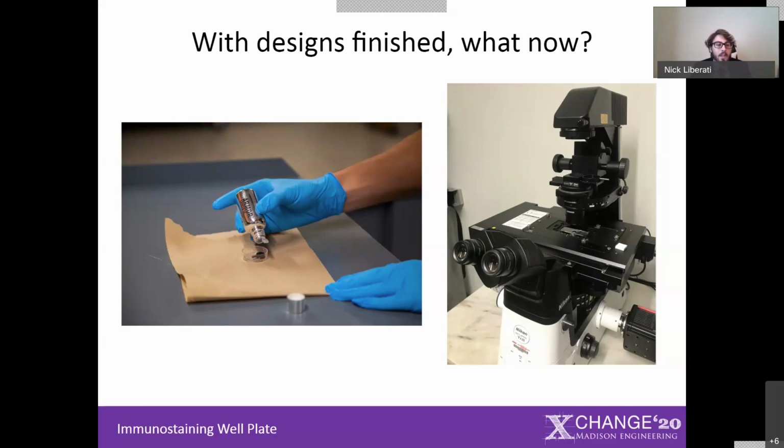Through this research, it became apparent to us that glass was always going to be our best option. But unfortunately, through further research, we found that manufacturing either of these designs out of glass would be well over the budget we had intended to spend. And so we began to look for cheaper alternatives. This path ultimately led us to surgical grade steel, aluminum, and ceramic coatings.